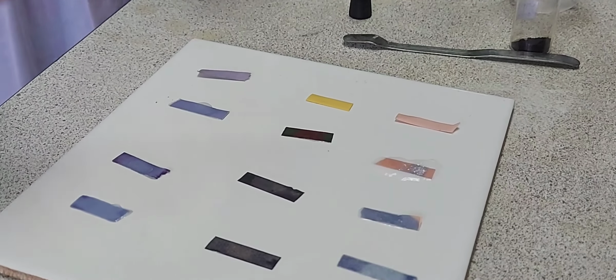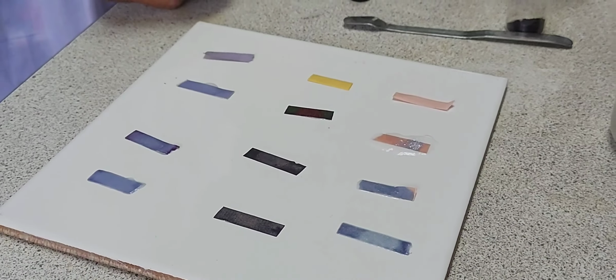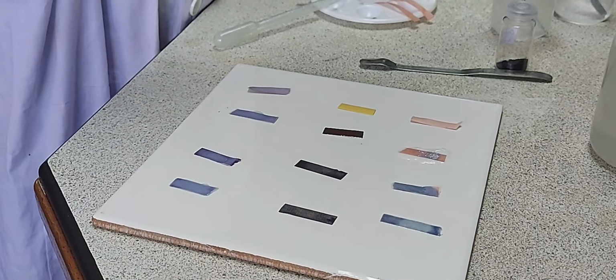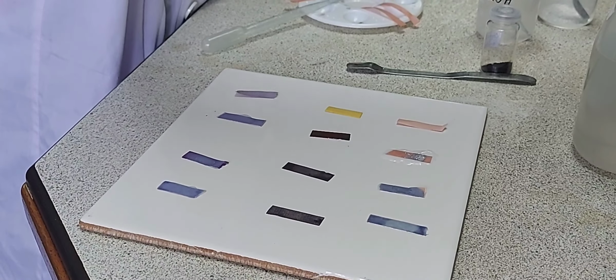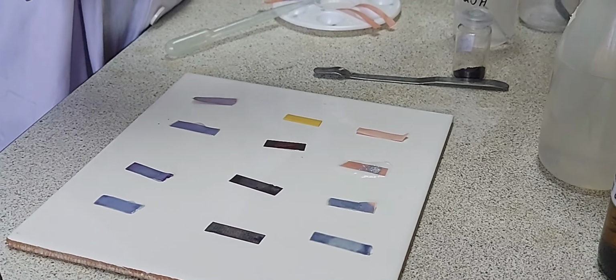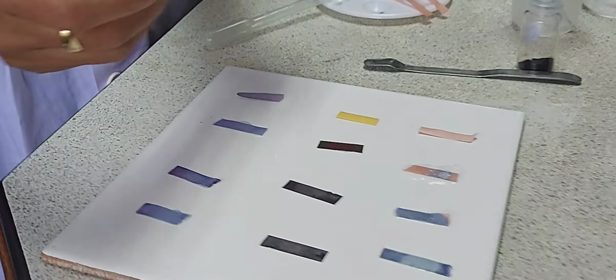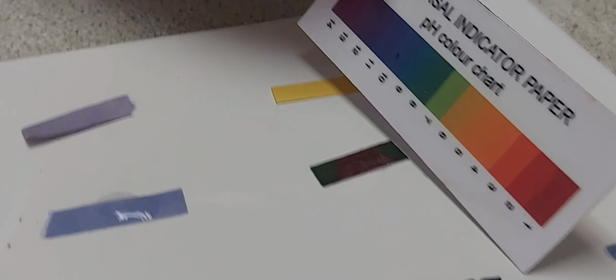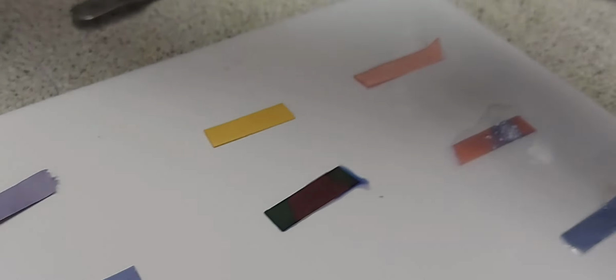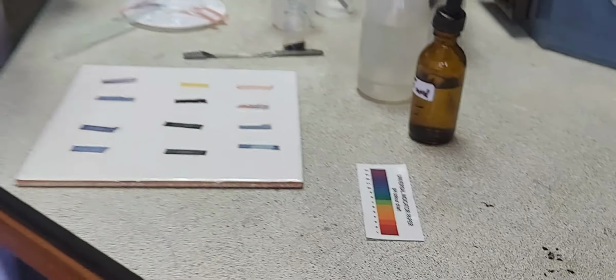So you can see that the litmus paper is turning blue, red litmus is turning blue, but it is a slow reaction. Whereas if you see the pH paper, it is having a green color. So 8 is the pH. So it is a weak base.